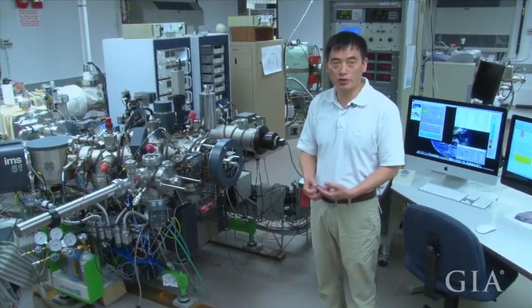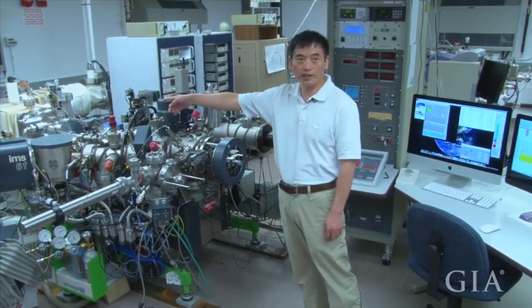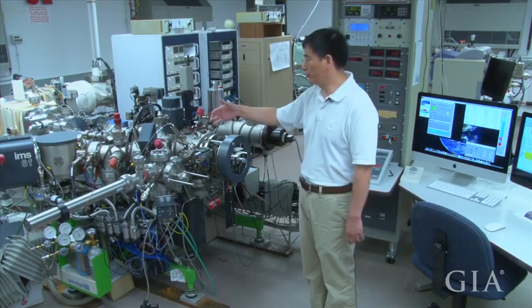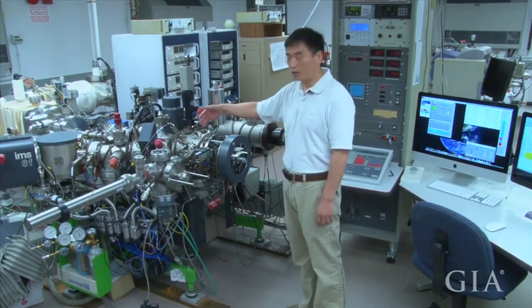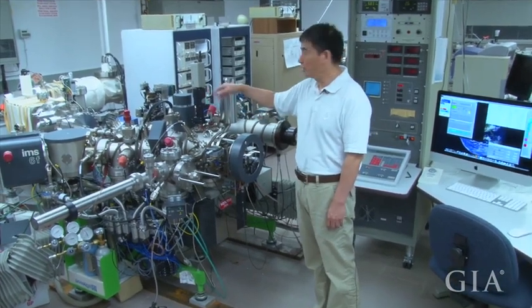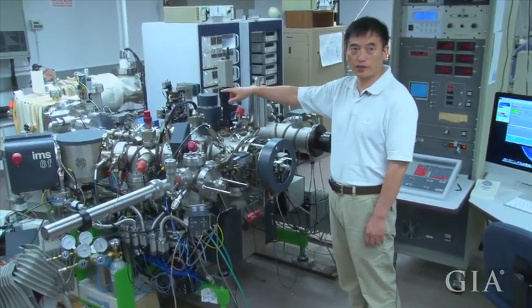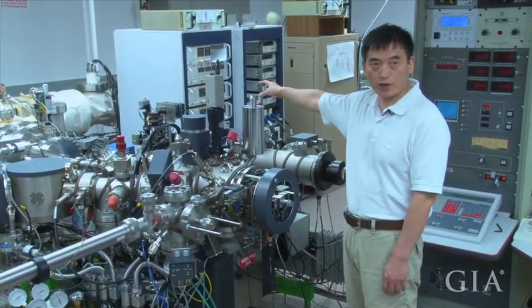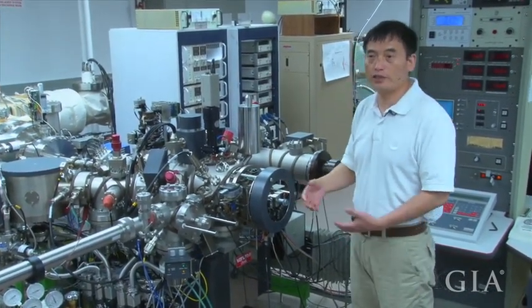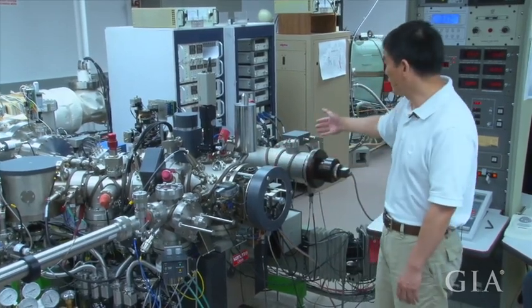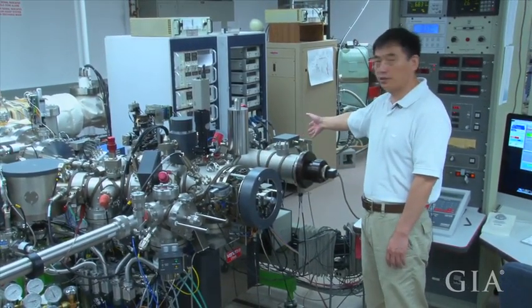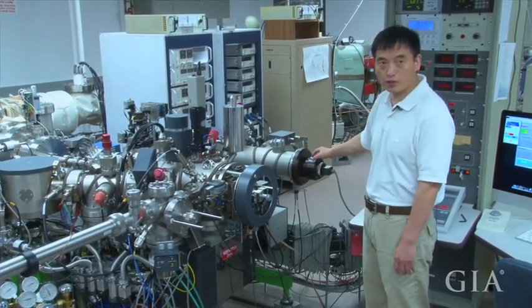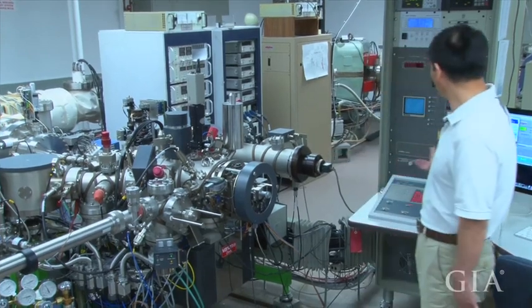We have a source of ions produced over there and the ions would be focused, accelerated to hit your target over here and then extracted through different electronic lenses, high voltage lenses, and passing through a mass spectrometer to be separated into different masses, then measured using different detectors over here. You can also display the ions using this channel plate and it's shown on the computer.